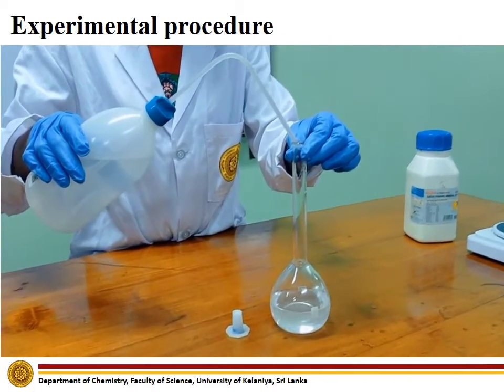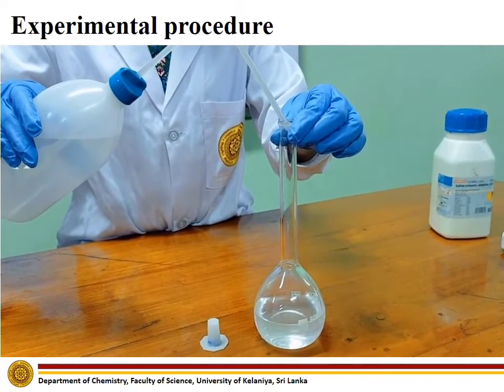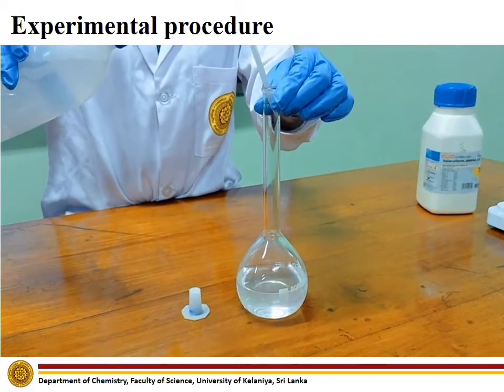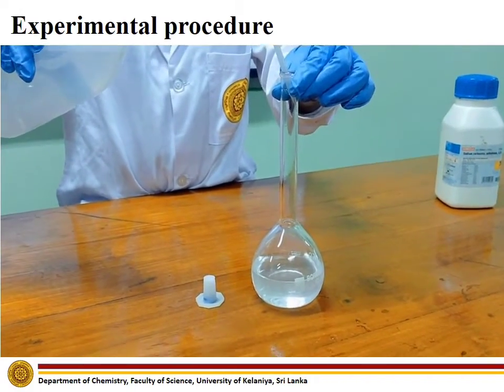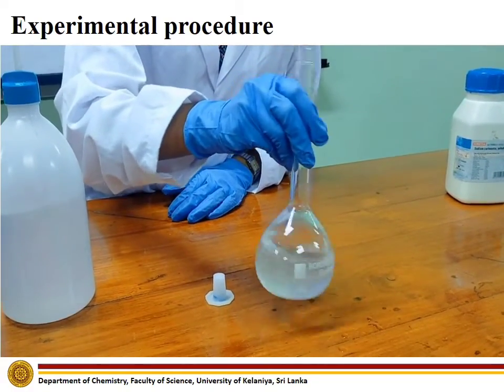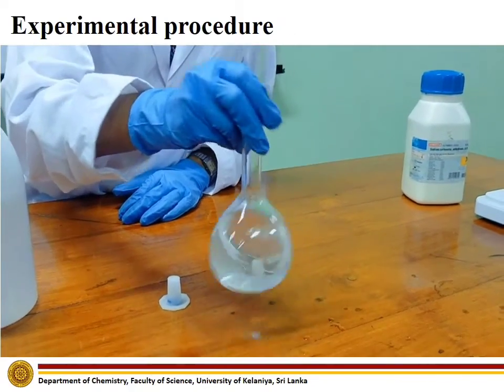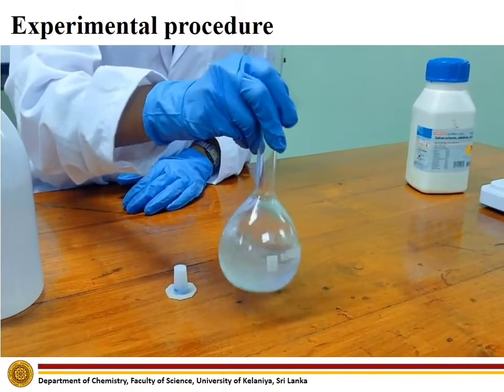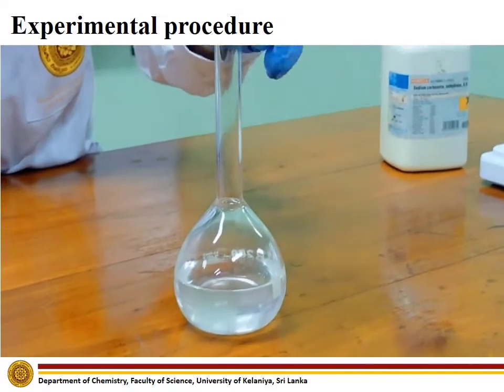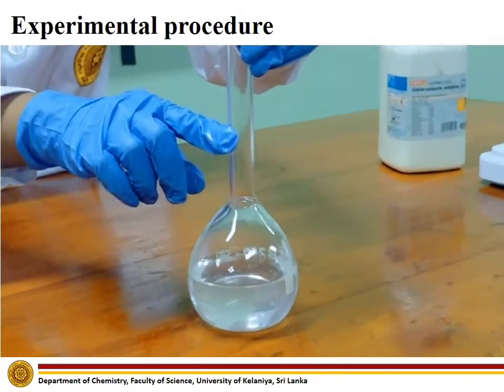Add distilled water and dissolve the solid completely. After sodium carbonate has been dissolved, top up the solution up to the mark of the volumetric flask using distilled water.